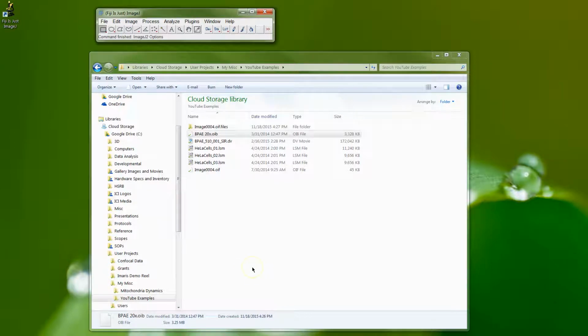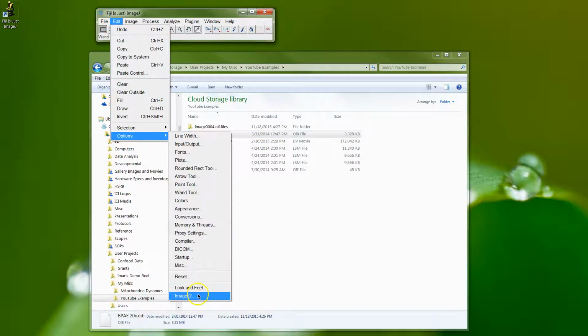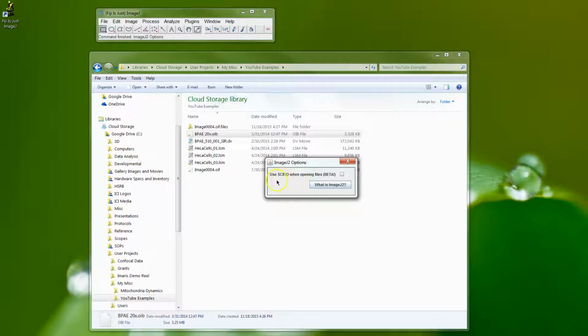Hi, we're going to do a quick aside on Bioformats importer and opening files in Fiji. Let's just quickly show the options ImageJ2, which shows this scientific file input output thing, which I believe comes checked on the first install, but I like to have it unchecked. So let's start with that for the moment.